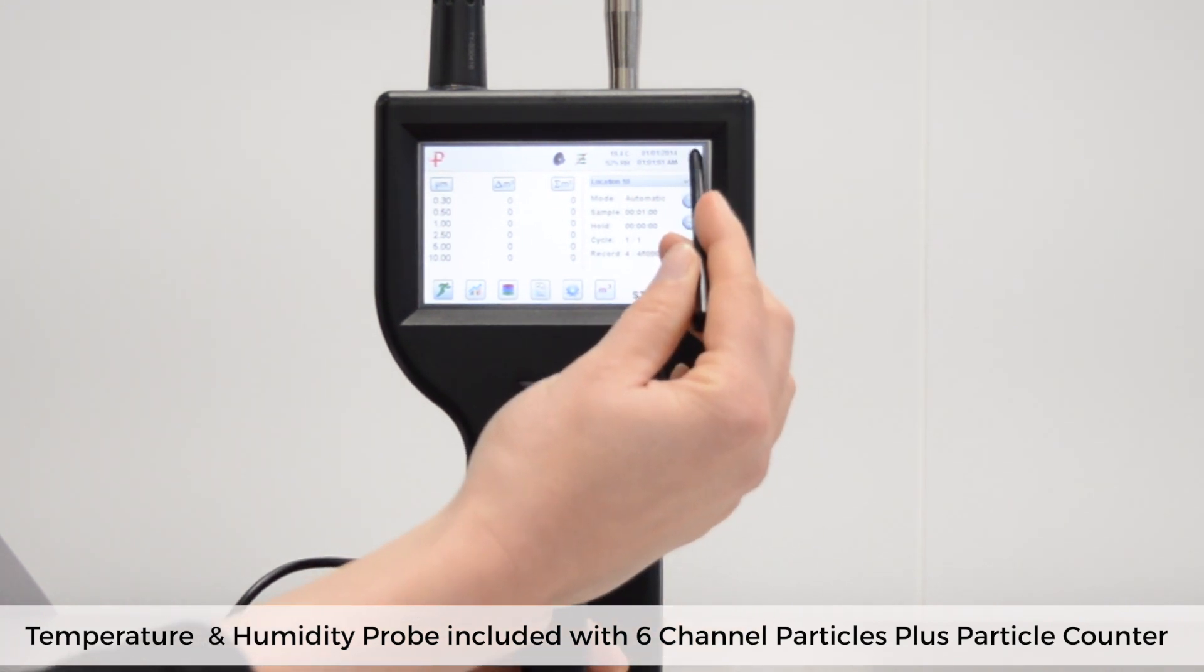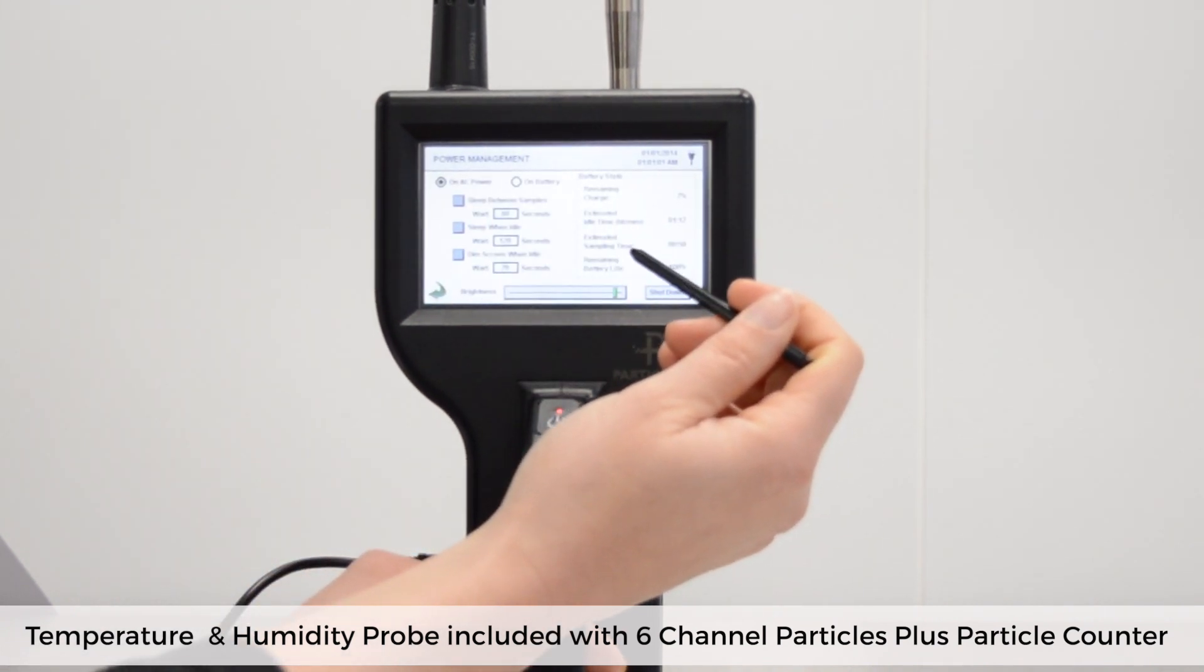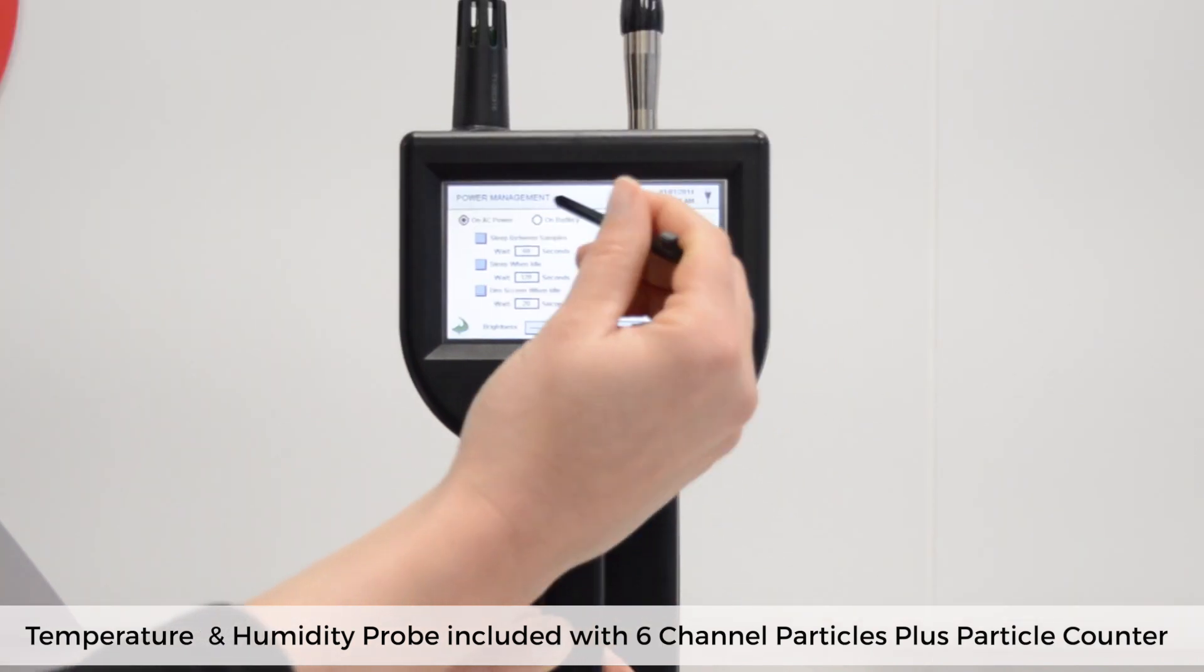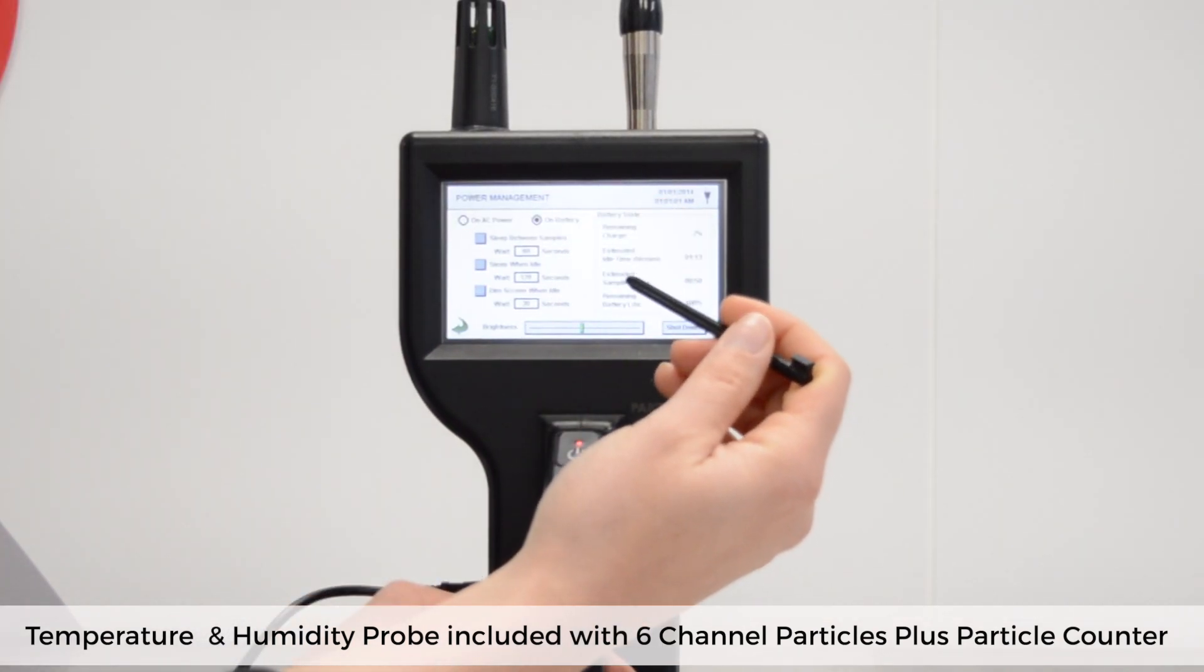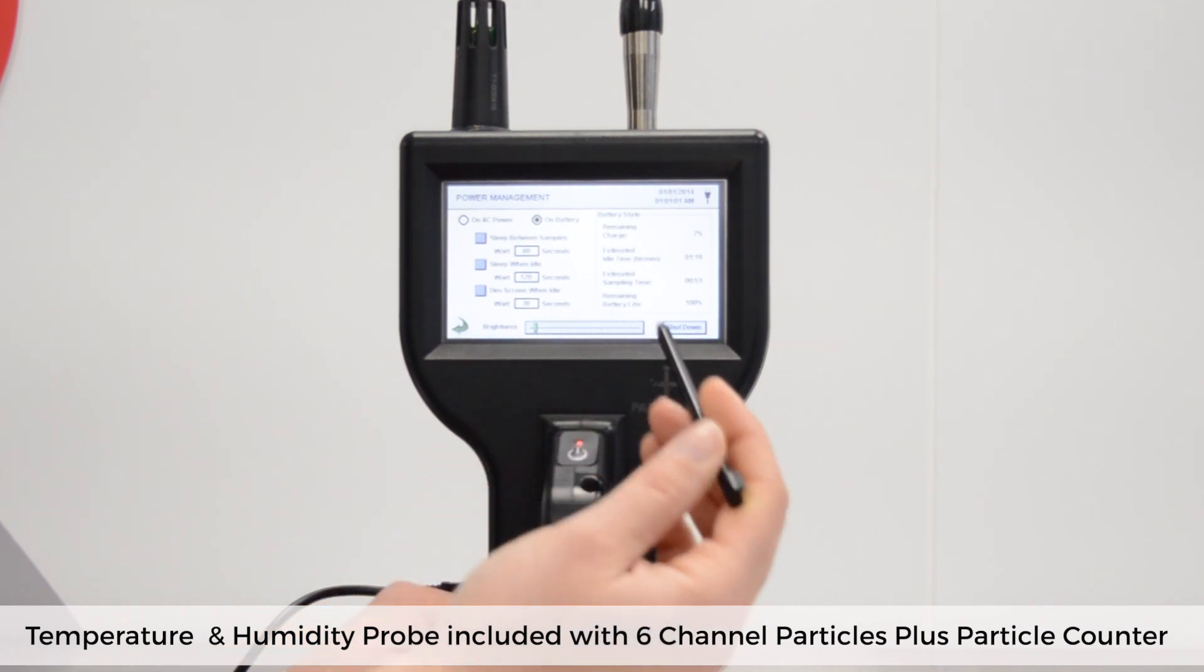If you click on the power icon you are taken to the power management screen. Select on battery to vary the setup options when the unit is powered by the battery. If you set the brightness level to low, the battery life extends.